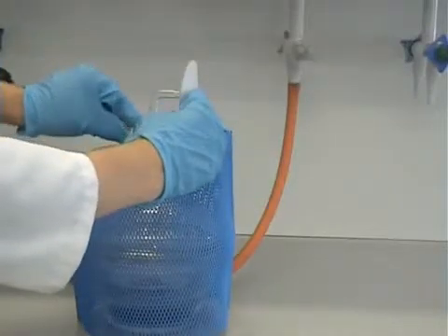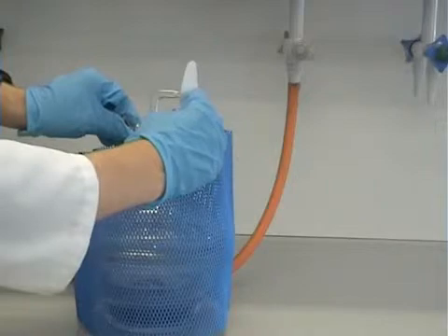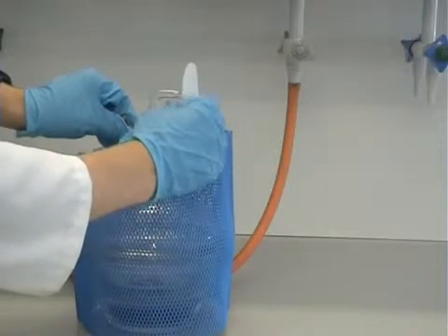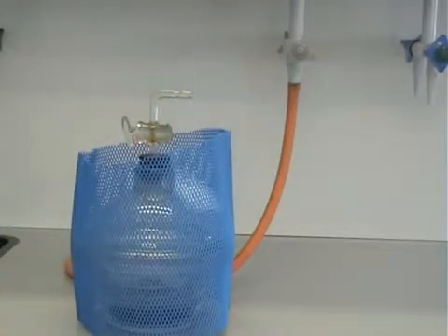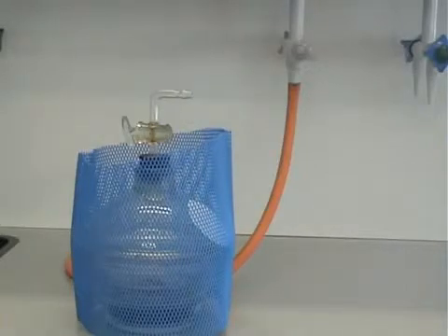To open the desiccator, place a piece of filter paper against the top, and slowly open the desiccator tap. The filter paper should stick, and then when the pressures have equalized, it should fall off.